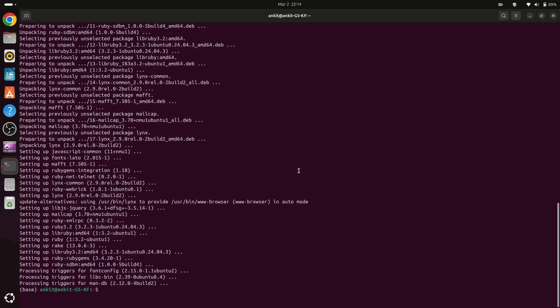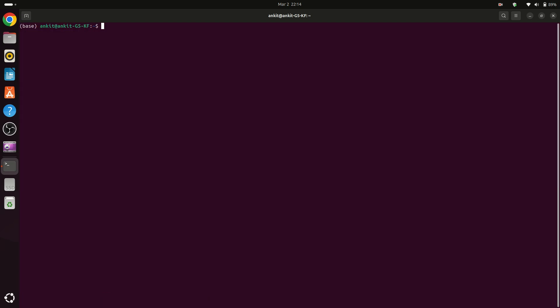Because of MAFFT we can align our sequences in our local system and we don't need to run Clustal or Clustal Omega. Now we can type clear to clear the output and then type ls.